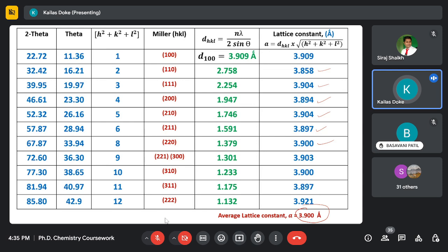This is a nanomaterial, a solid material obtained from biosynthesized gold nanoparticles, and it gives some intense peaks. One is at 38.1 2 theta, second is 44.3, third is 64.5 2 theta, and the fifth is 77.7. And they were indexed in the research paper as 111, 200, 220, 311.